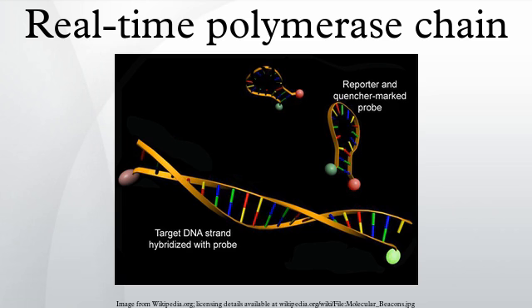However, fluorescent reporter probes do not prevent the inhibitory effect of the primer dimers, which may depress accumulation of the desired products in the reaction. The method relies on a DNA-based probe with a fluorescent reporter at one end and a quencher of fluorescence at the opposite end of the probe. The close proximity of the reporter to the quencher prevents detection of its fluorescence.